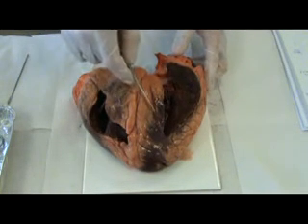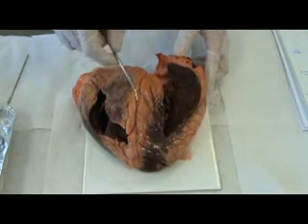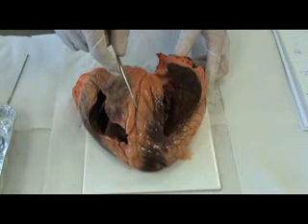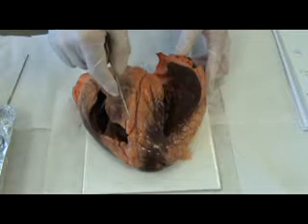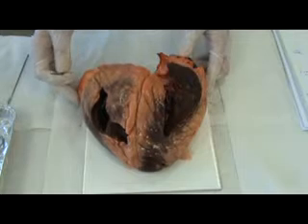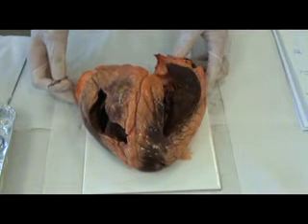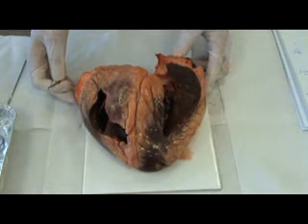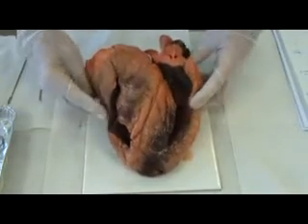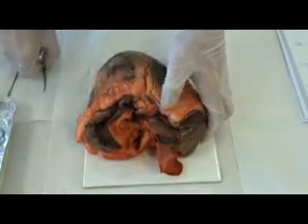So hence, it's very important that there are no blockages through deposition of cholesterol, and there's no hardening of the coronary arteries. And indeed, there's no blockage of the great vein. It's carrying away the waste products of metabolism away from the heart, so there shouldn't be any blockages. The coronaries actually begin in a section of the aorta. And what we're going to do is look at the superior view of the heart and discuss some of the great blood vessels seen there.